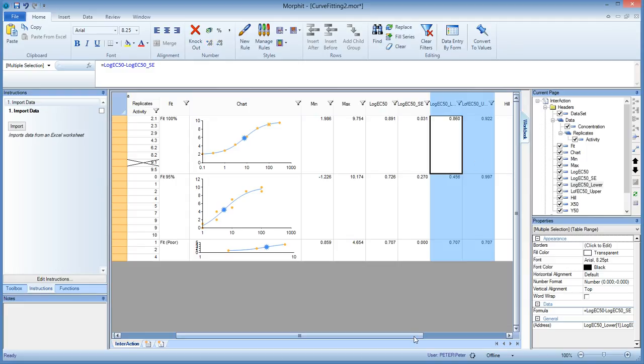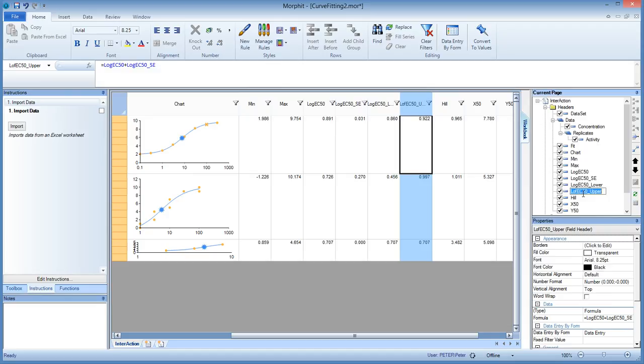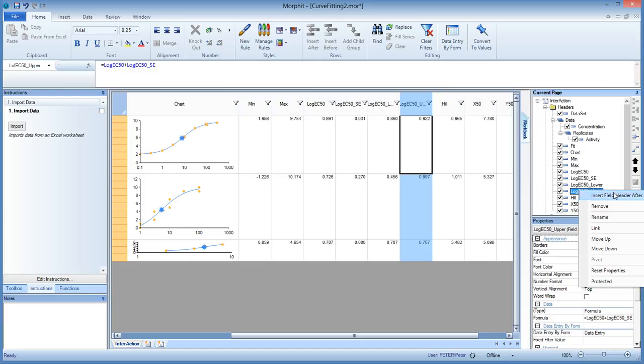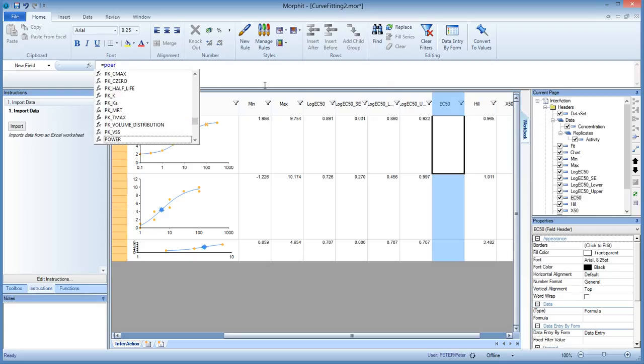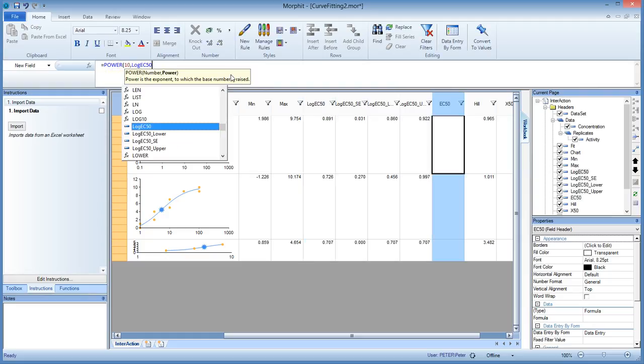And now we are ready to plot the log EC50 as a bar chart. But before we do that, I want to explain you that sometimes you don't want to plot the log EC50, but you want to compute the EC50 itself. So let's do that as well. I see there's a little typo here. Let's change that. It's just the name of the field. Now we insert a field called EC50, and that is computed from the log EC50 by taking the power of 10. So is the power 10 log EC50. So this is the way to compute the EC50 from the log EC50. Very simple formula.